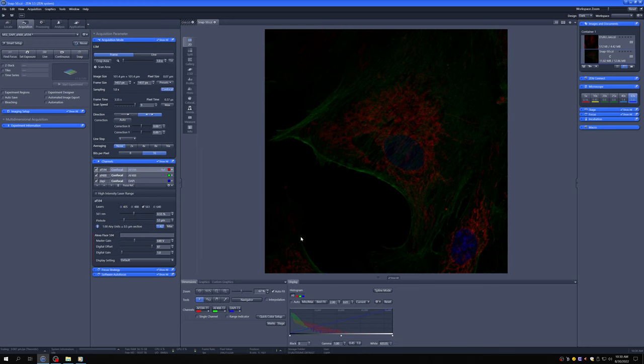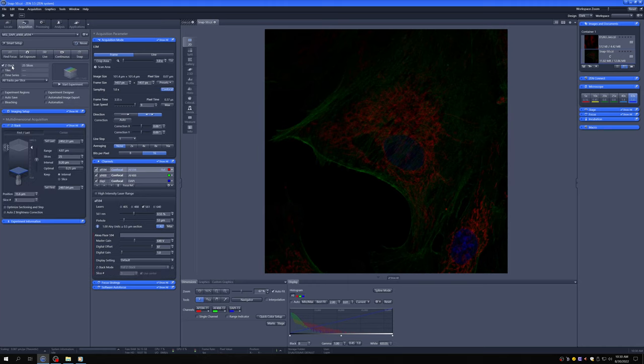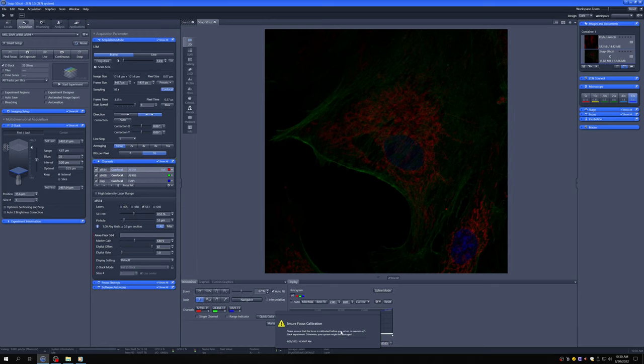Then, once we're happy with that, we can engage Z-stack mode, and that will open this up here. You can ignore this ensure focus calibration. That doesn't apply to you.